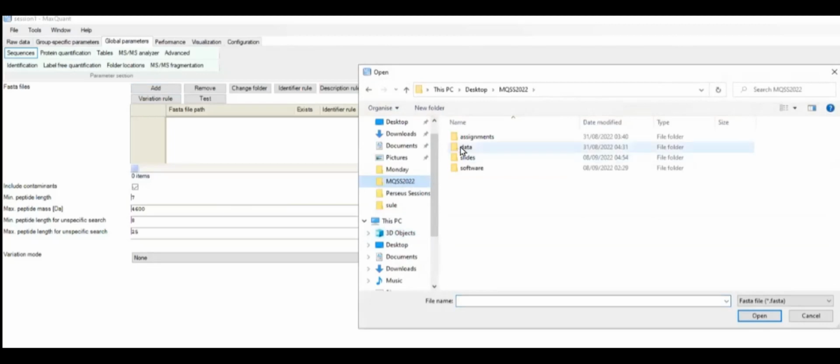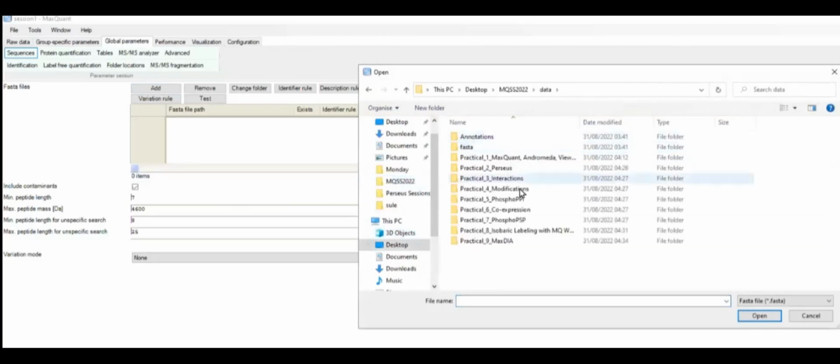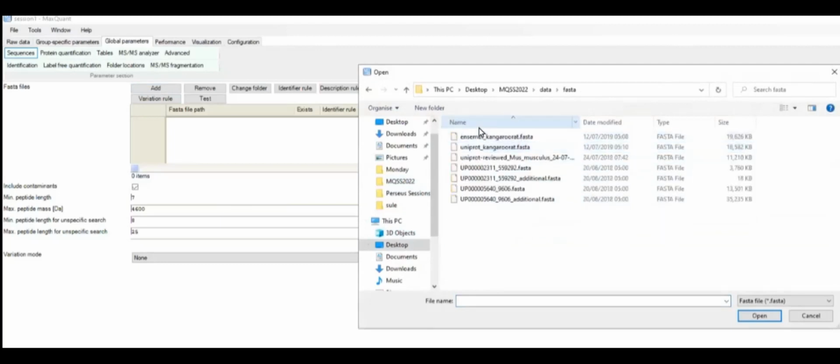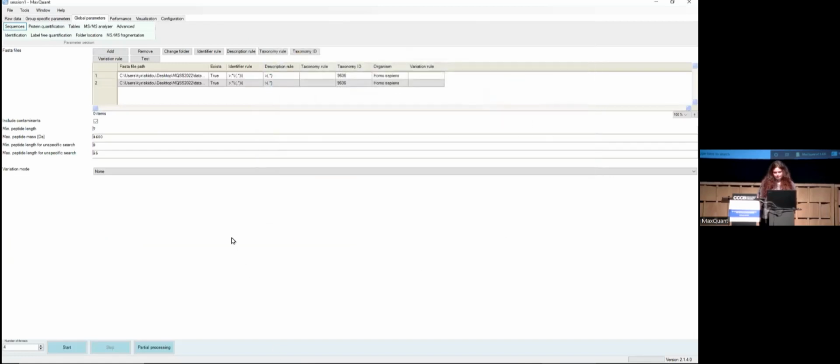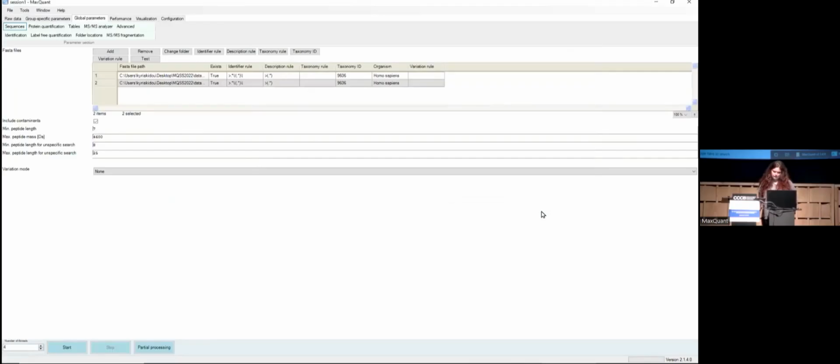And you have them under FASTA, I guess. And you just open them. That's it. And doing this, everything is done. Just be careful here. I don't know if I'm correct, but that one, number of threads. So here you have to check the size of the memory that you have in your server.